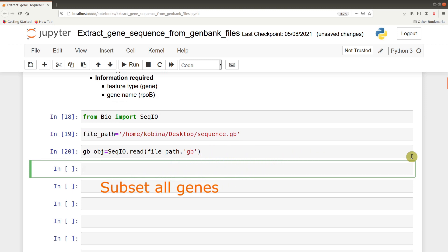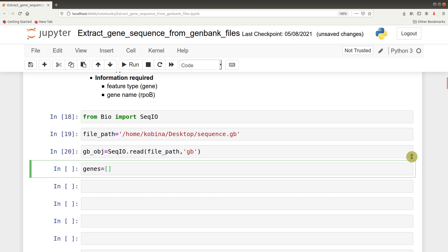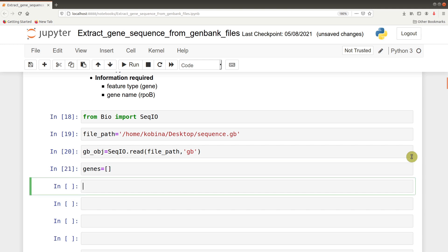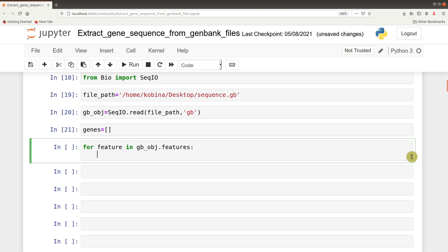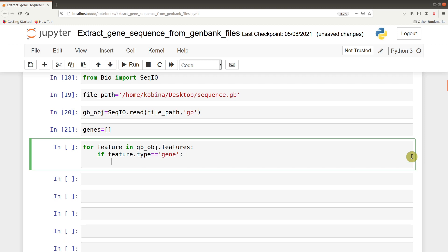The next step is to subset all the genes - all features of the type gene. We begin by giving an empty list, genes equals this empty list. After creating that empty list, we'll use an iteration to get all the gene features. We say for feature in gbobj.features, if feature.type equals gene, then genes.append feature.